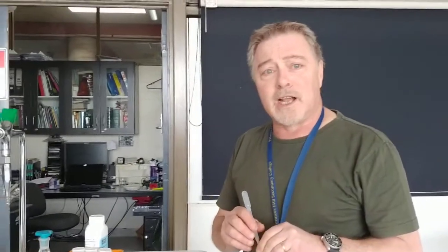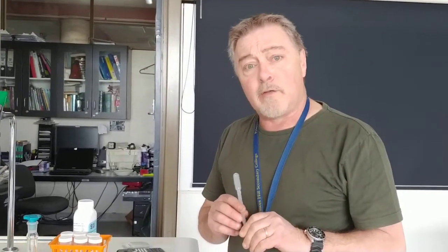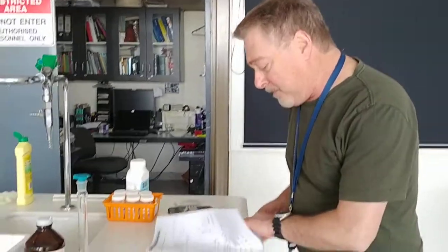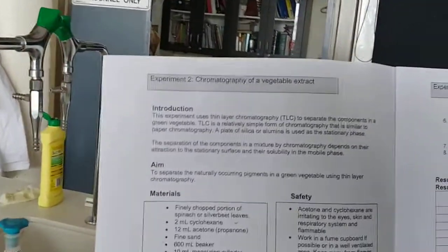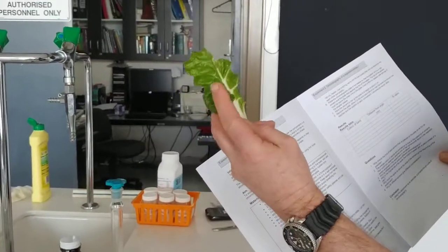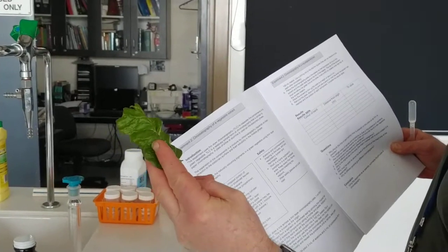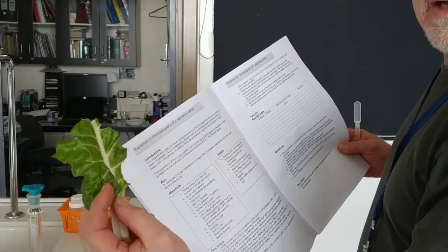What we're going to be doing today is running a prac, and the prac is a chromatography prac. Specifically, the one we're going to be looking at today is the chromatography of vegetable extract. The vegetable that we're going to be using is silver beet. So that's the silver beet there. Very greeny, leafy plants. We're going to extract some of the juices out of this plant, the chlorophyll and whatever other chemicals are in there.